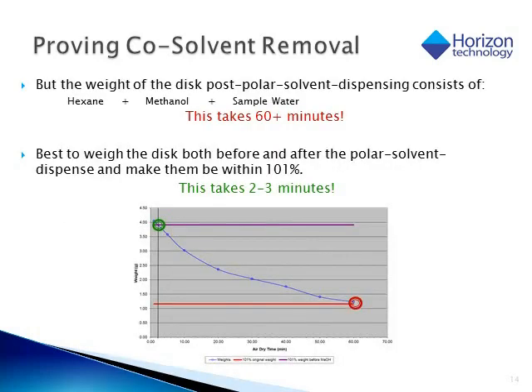While the procedure makes sense, the problem is that there are a lot of interferences which are introduced to the disc in that time. In testing that was performed, this technique ended up taking more than an hour for the disc weight to drop to 101% of the original weight.